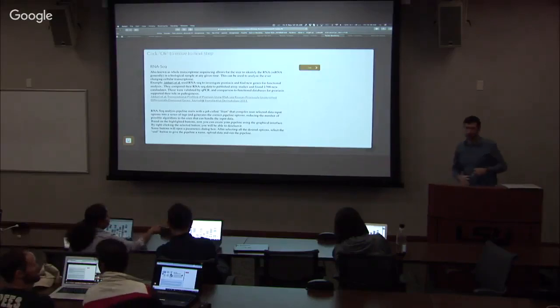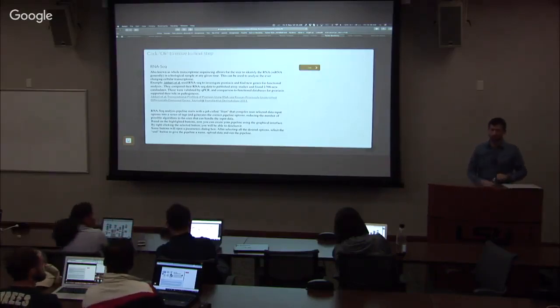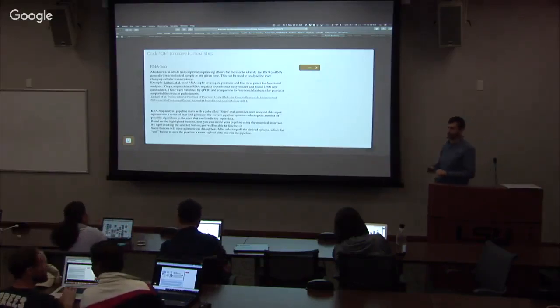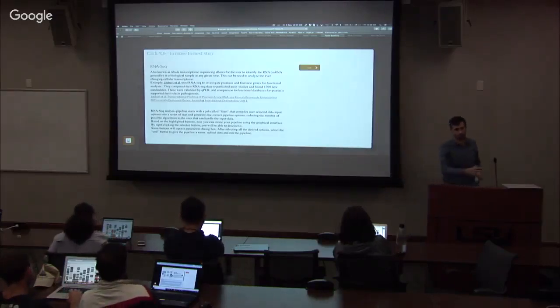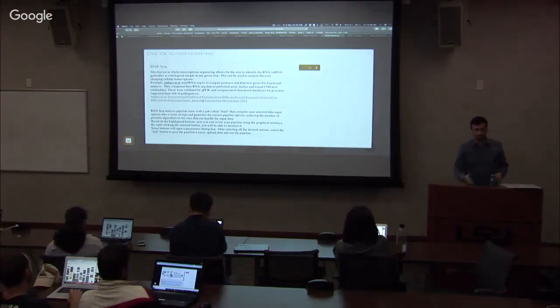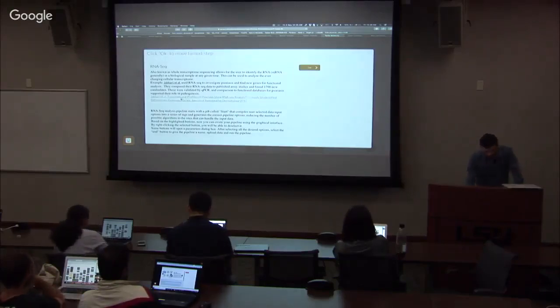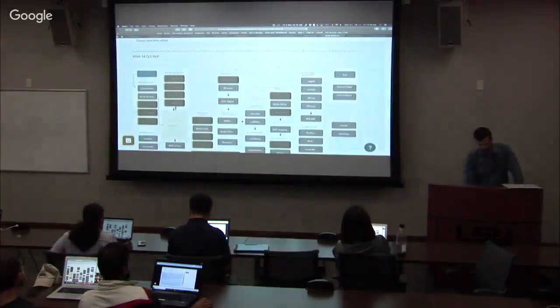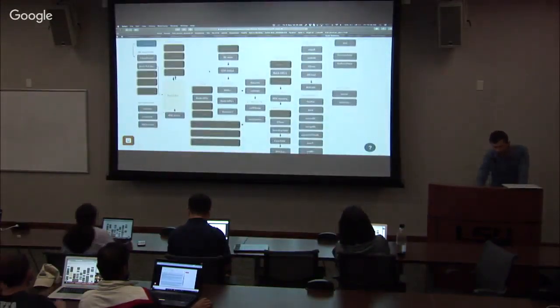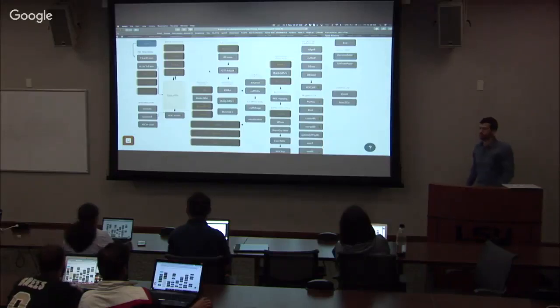So now we can use the files that were uploaded. Okay, so after the files have been uploaded, you just press on start, right? And so the pop-up shows you kind of what's the process, and you can read this publication to read more about RNA Seq. But now, after we say OK, we see some options available to us.